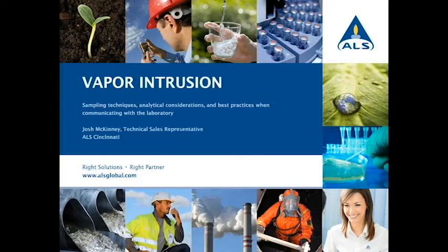A little background on this particular presentation. The title is Sampling Techniques, Analytical Considerations, and Best Practices when Communicating with the Laboratory. When I started with ALS in 2014, I previously did not have any experience with vapor intrusion sampling and testing in my laboratory career, and since then I've learned a lot.